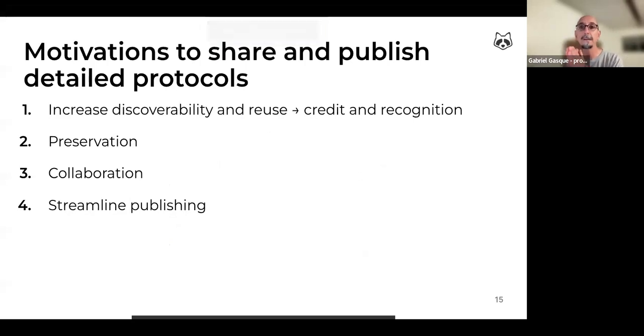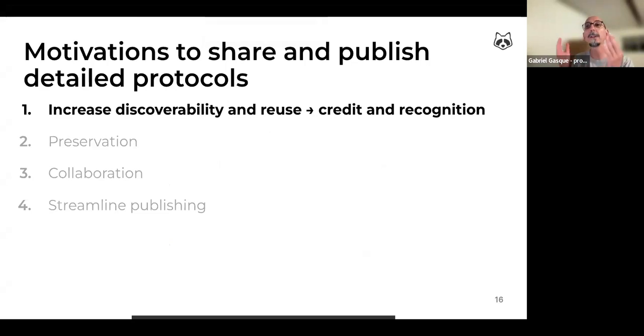Now, let's discuss why we think it is rewarding to create and publish detailed experimental protocols. Not necessarily in order of importance, but a first advantage of making your methods public is that by using specialized repositories to publish your protocols, you are increasing the chances that they will be discovered and reused, which should lead to increased credit and recognition.